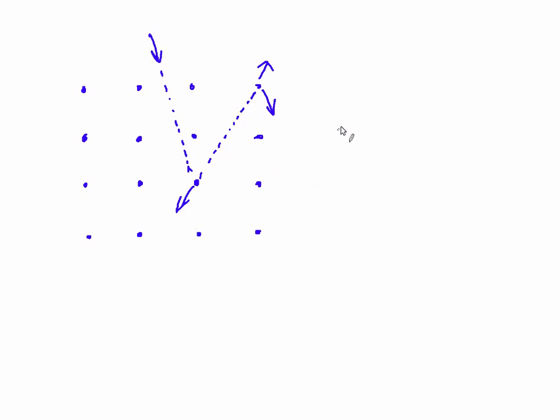In detail, there are three modes to generate secondary ions. The first is direct collision scattering, where the primary ion interacts with the surface atoms directly and ejects ions from the material surface. This process is rather fast.